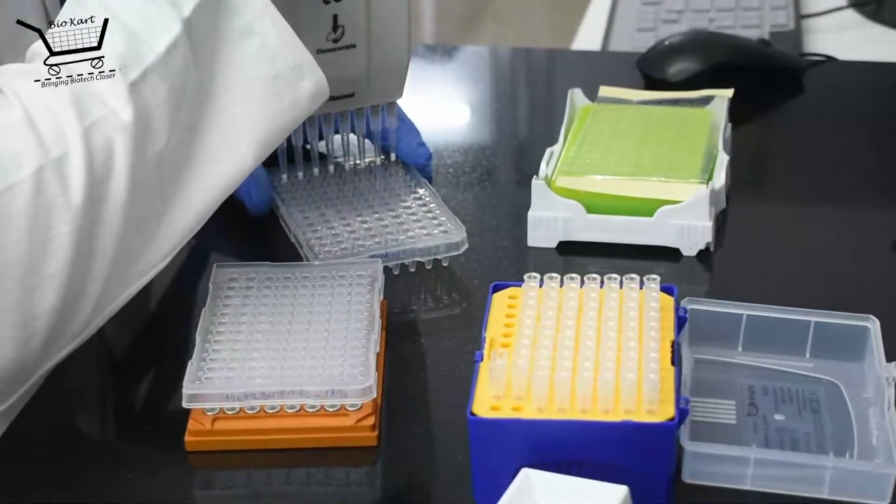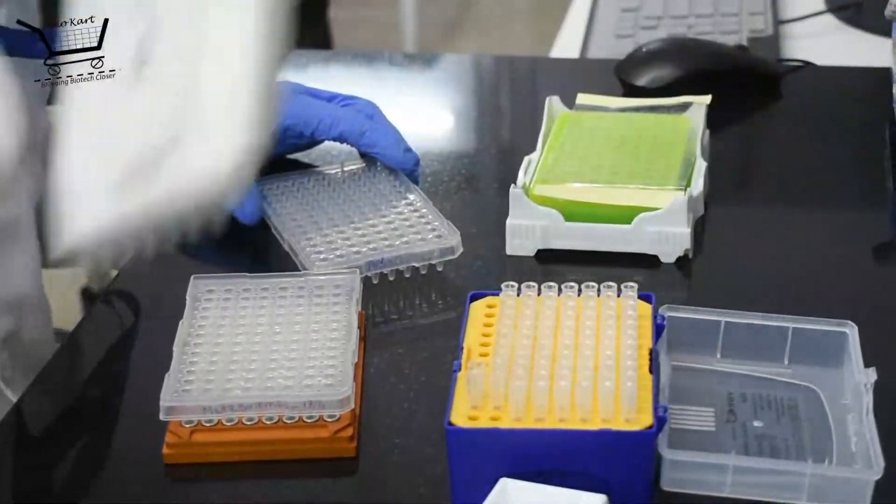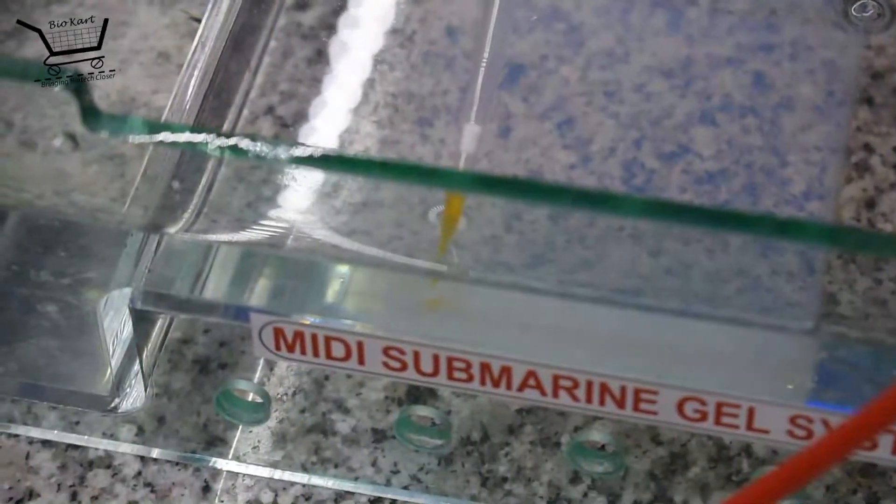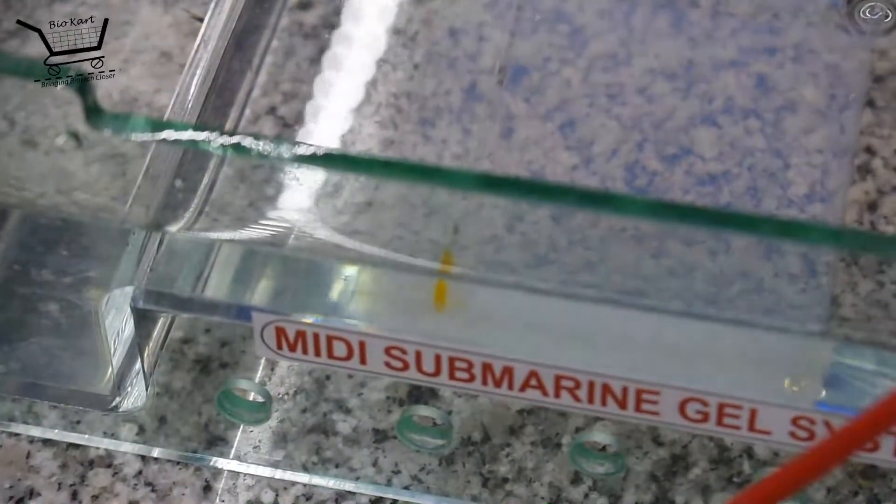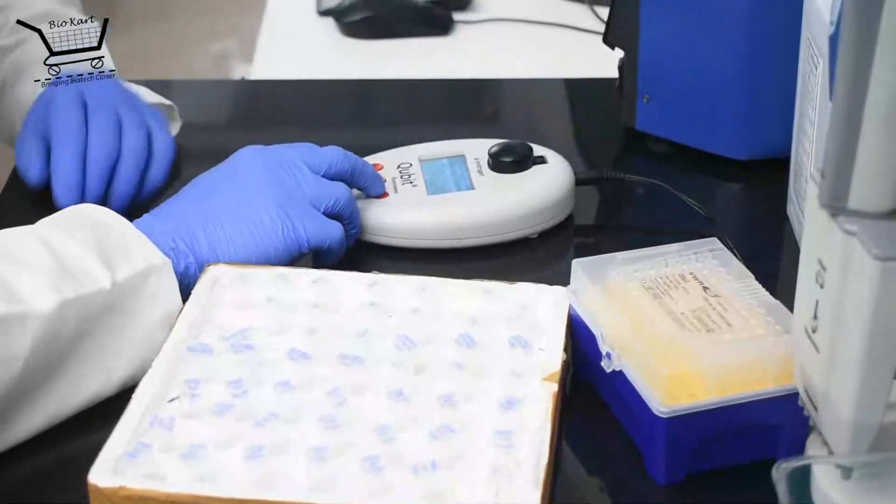After magnetic purification, the PCR product is subjected to another round of gel QC and concentration check. The concentration check is done using Qubit. Once the quality check has passed our criteria, barcoding is carried out with another set of PCR reactions.